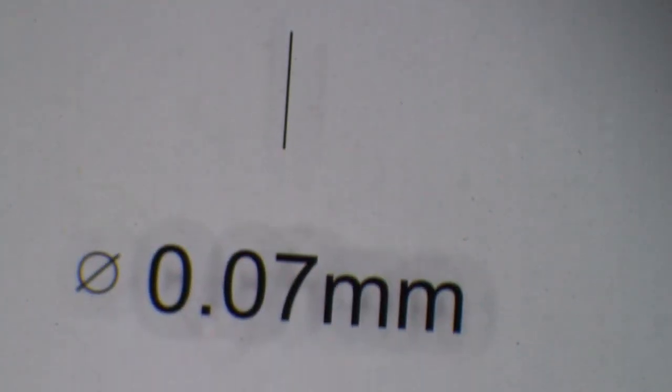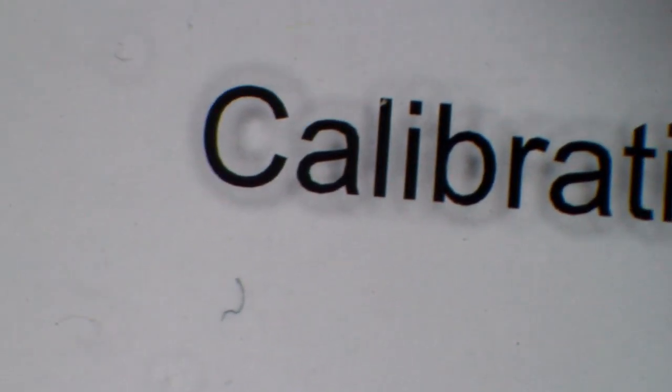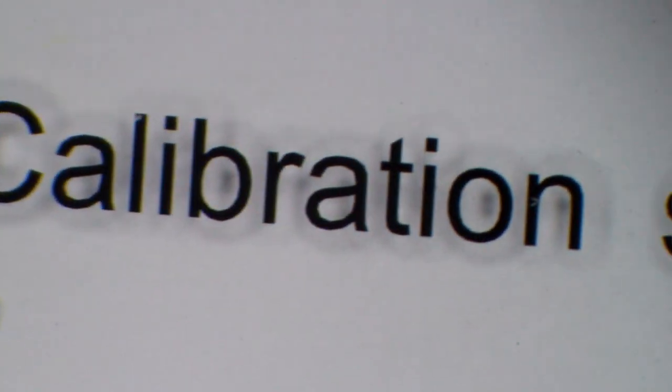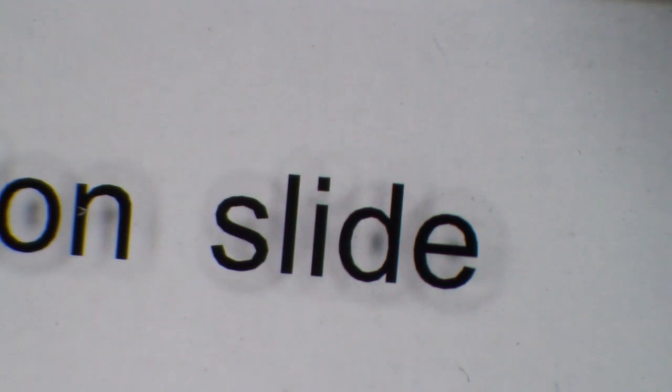So what we're going to do now is I'm going to now go under my compound microscope, and I'm going to take a picture of these now. And let's have a closer look under my compound microscope.